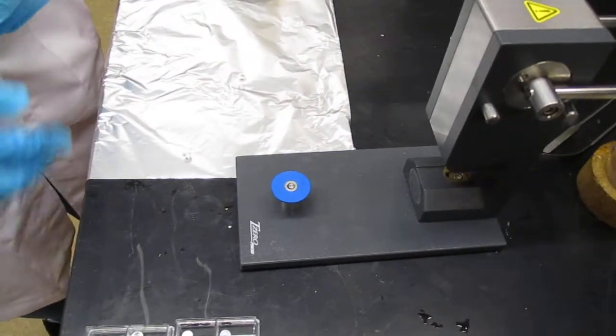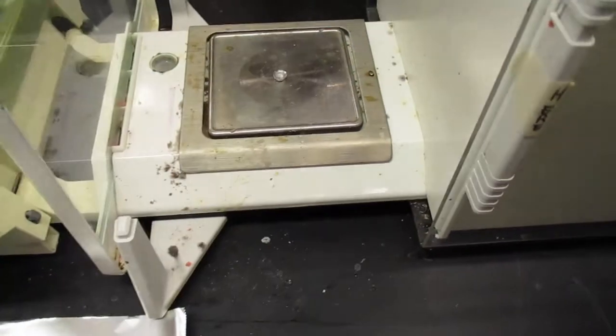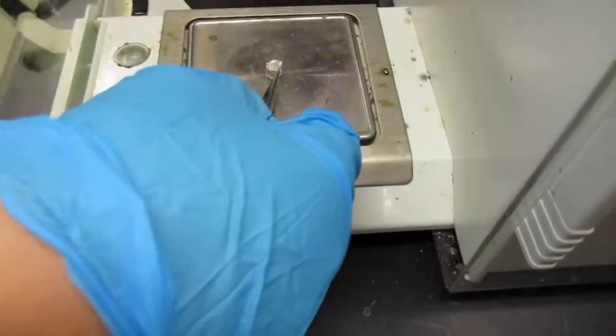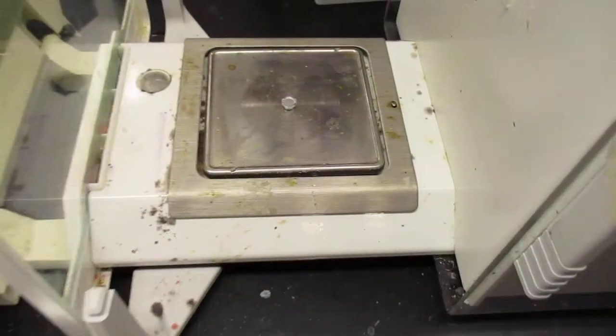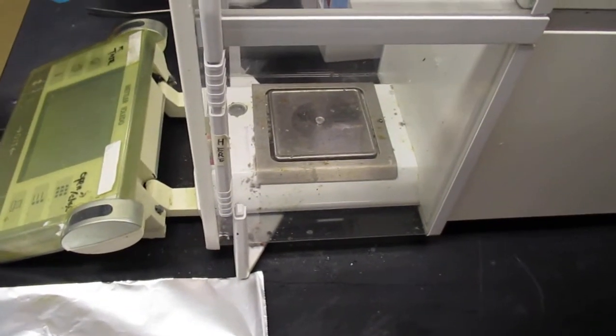Now grab a brand new pan and lid, and we're going to place it on the scale, so both the pan and the lid empty, and we're going to record the mass of that. Write that down in your notebook. This will be for sample one.